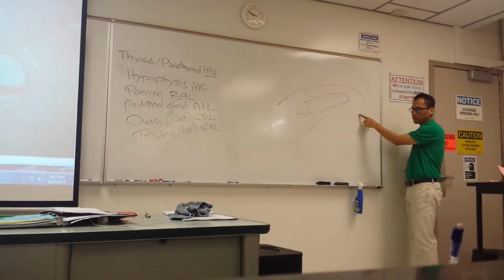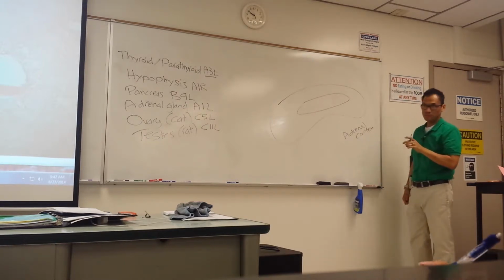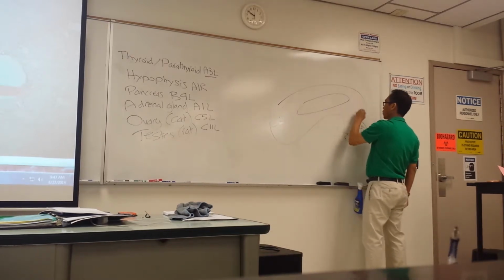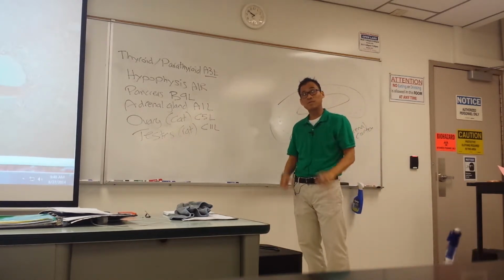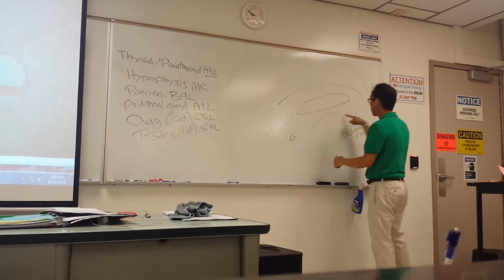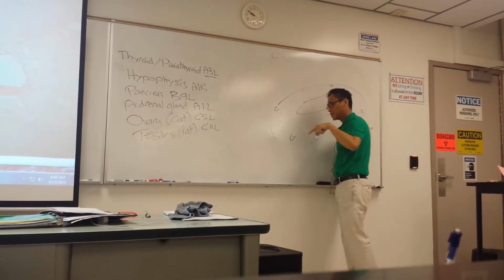What is the outer part called? Cortex or medulla? Cortex. Adrenal cortex. You know, there's 3 zones. The outermost zone, if I can kind of divide it into zones, all the way around. I'll just put G. You should have listed in your study guide what zone G is. What's the full name? Zona glomerulosa. And it's G all the way around, all the way to the outer part. Okay. That zone secretes aldosterone.